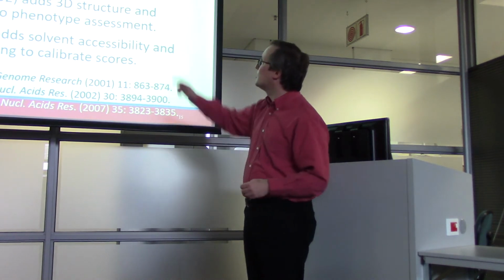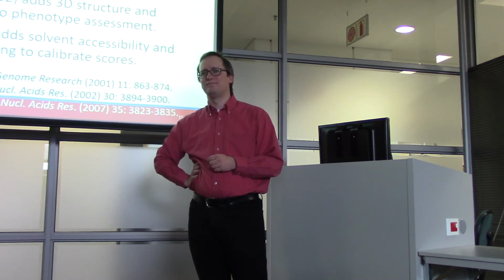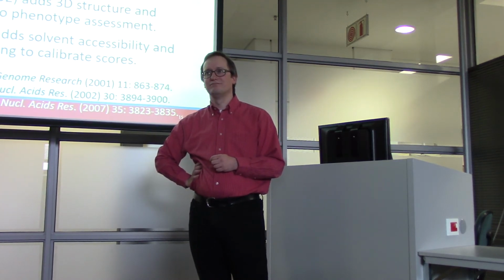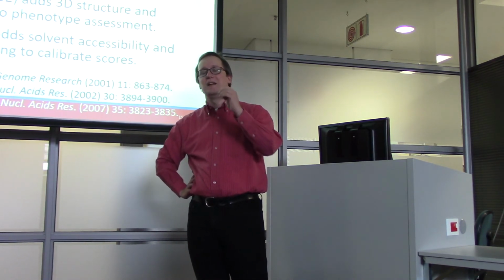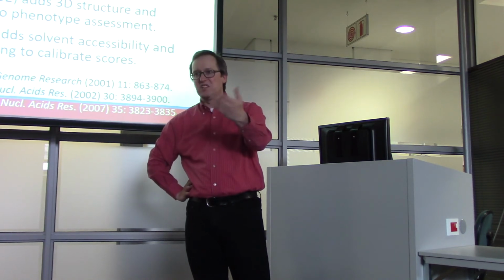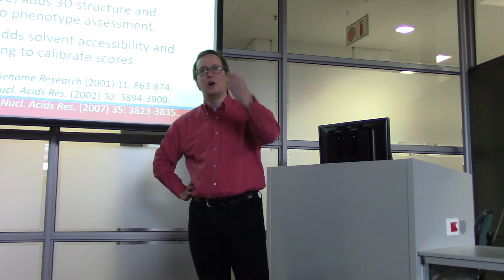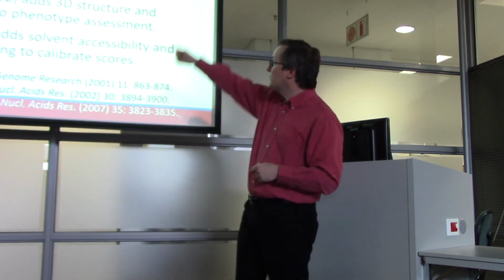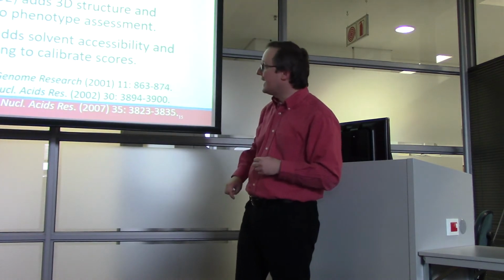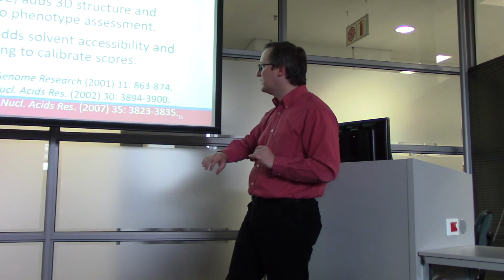Okay, so is it deleterious? What does deleterious mean? Not necessarily a deletion. Does it invoke a deletion? But is it harmful? That is really the context in which we use that term here. So is a mutation harmful to the function of this particular protein? There are three algorithms that I highlight here. Again, there's a world of them out there, but these three are pretty widespread.